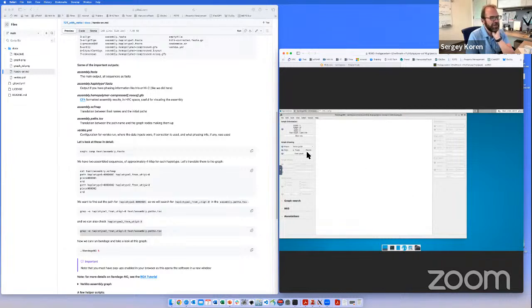And so if I open this and I draw this graph, we get this nice picture of the graph where each one of these long bits is a sequence. You can see their names when you click on them: UTIG41, UTIG42, UTIG3. You can select multiple ones.